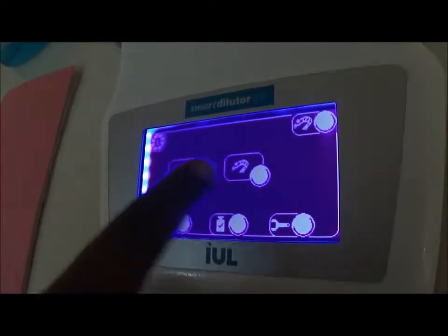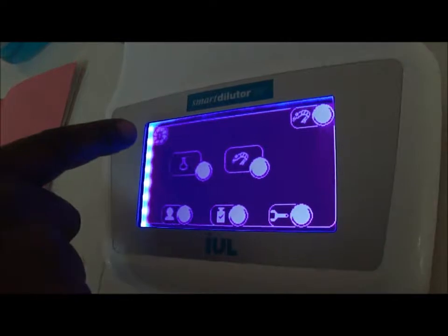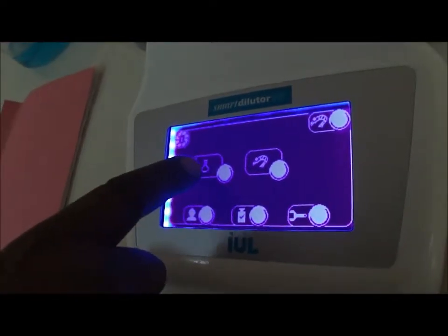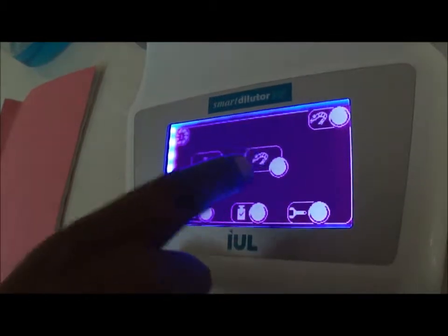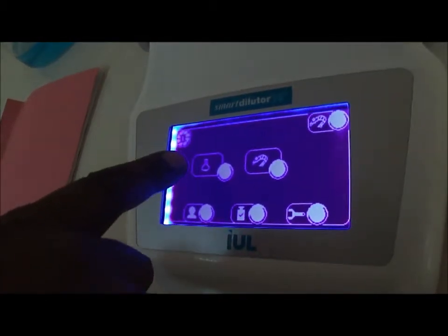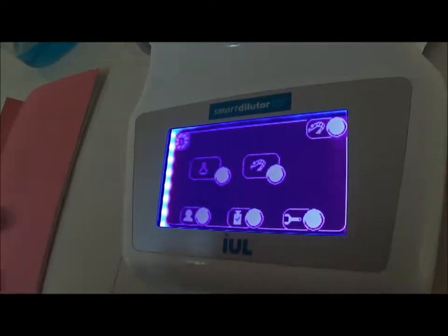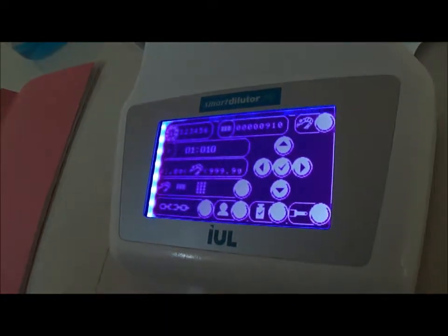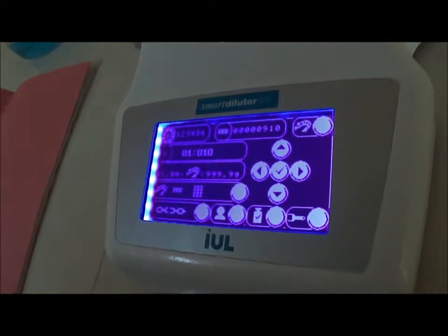You enter there, and you have two options for the pump numbers you have selected. You can select either dispensing or dilution. The syringe is where you have the dilution. You have this tube, where you have dispensing. In my case, I have selected for pump one, the dilution.